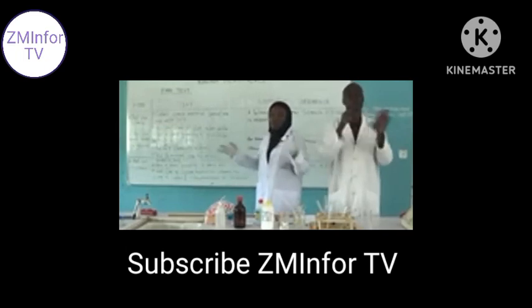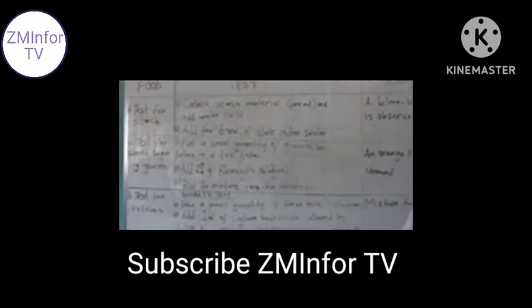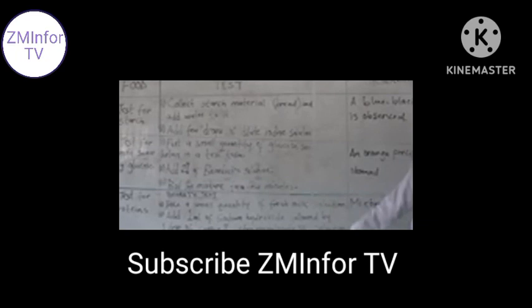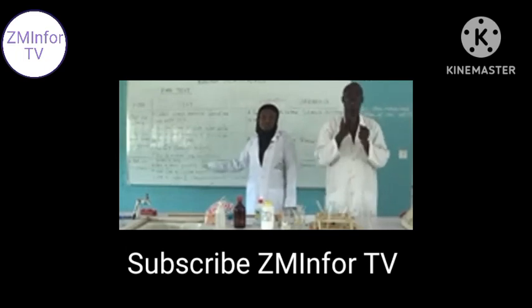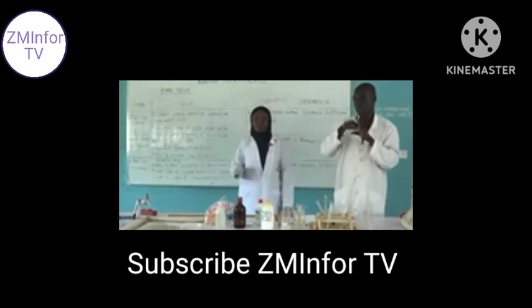We have seen the test for protein where we use fresh milk solution plus sodium hydroxide and copper 2 tetraoxosulfate 6. We have tested and we have seen the presence of these food materials in this food process.